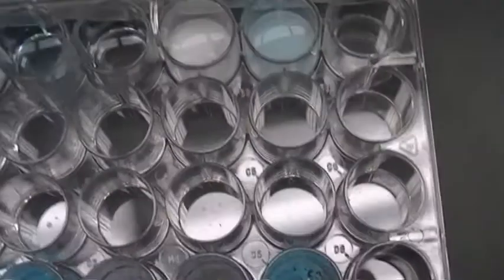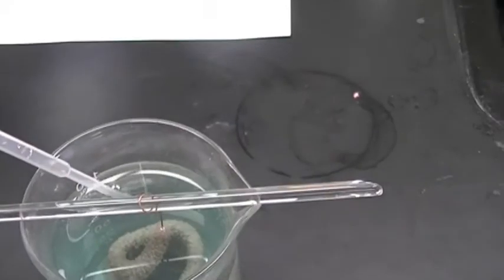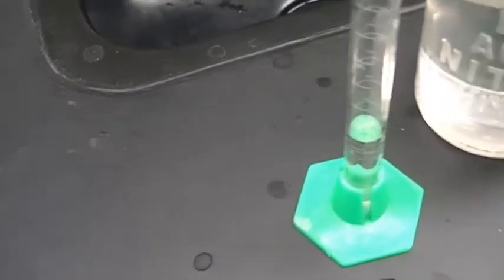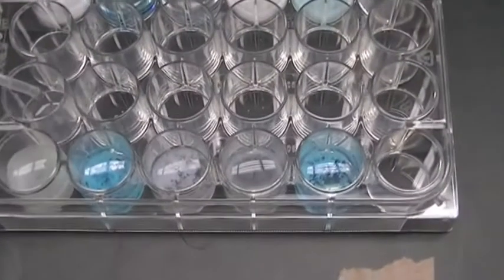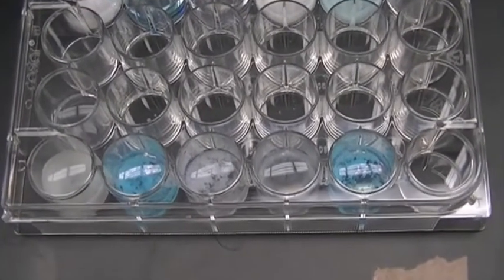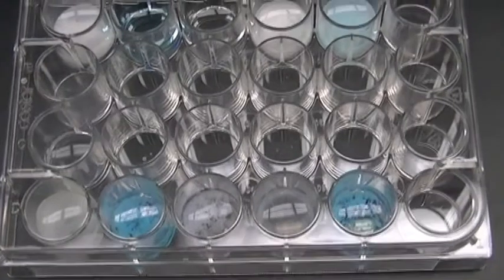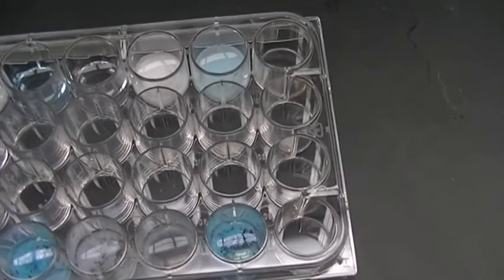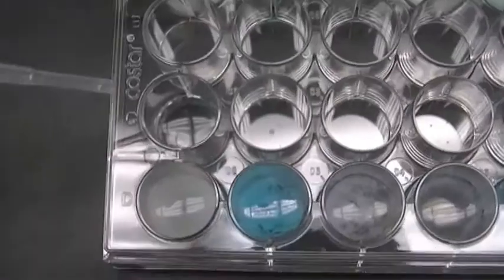So to test this, I will bring over our spot plate. I am going to take solution out and put it into a well here. If there's silver in there, when it reacts with the HCl, it is going to form a white precipitate.